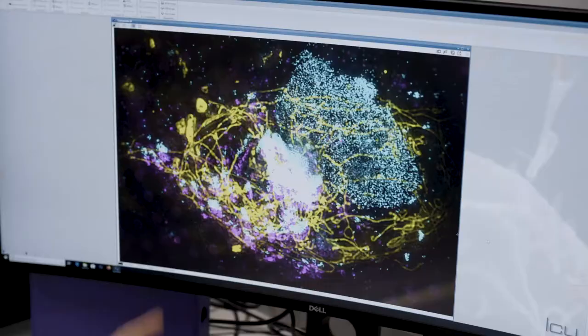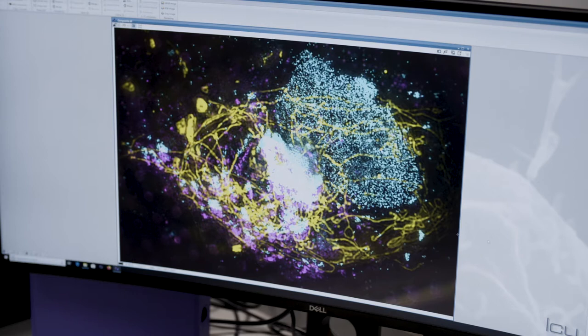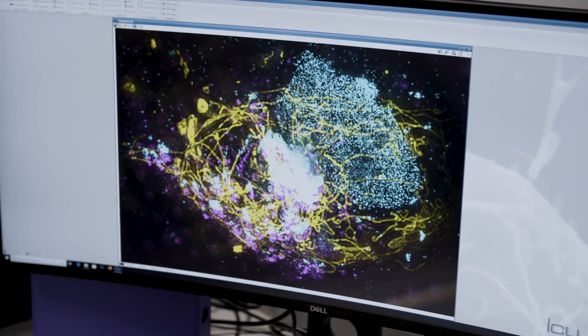The next thing we do is image them on two different microscopes. The first thing we do is image them on the cryosim, which produces this image. And then secondly, we image them on the x-ray microscope, which allows us to view the general landscape of the cell.